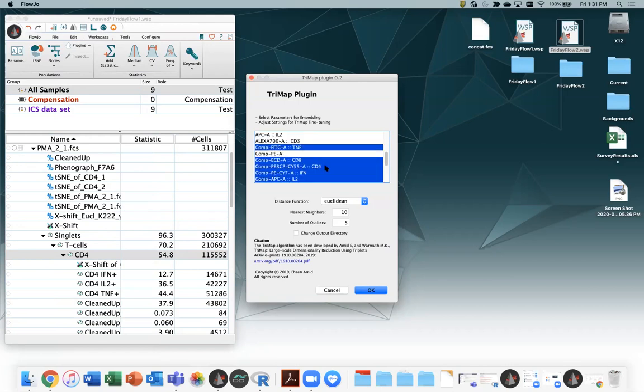I'll highlight the parameters I'm interested in. Distance functions: Euclidean, Manhattan, Angular, and Hamming. Basically different ways that you can approximate distance in a high dimensional space. Like when you have, say, 4 dimensions, what's the straight line between 4 dimensions? Well, you have to specify how you're going to do it. Euclidean is definitely the most common and the one I will pick. And I overall don't know that the data are particularly sensitive to the different distance metrics. It seems like a reasonable choice.